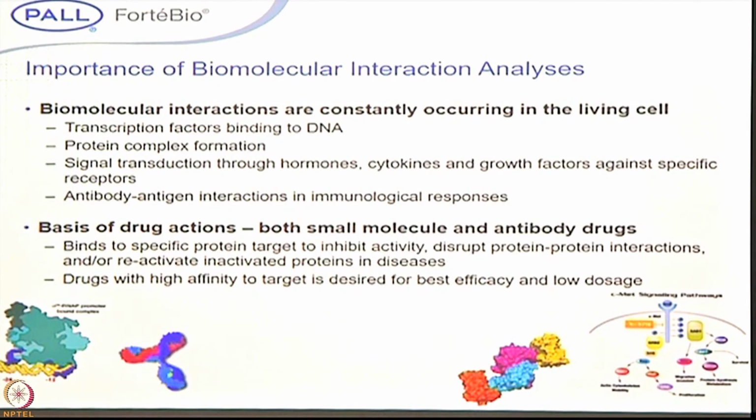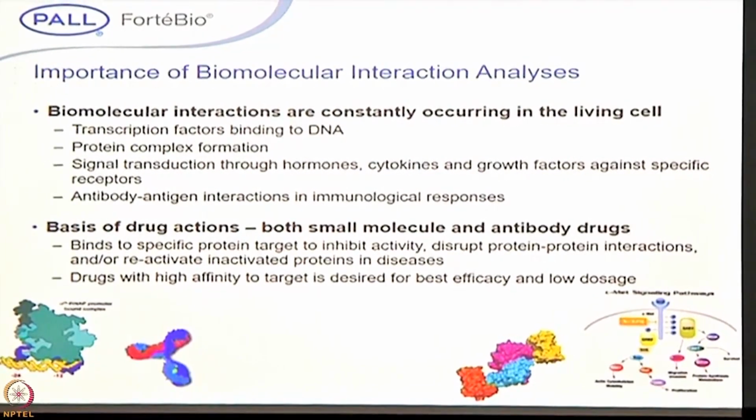Even when it comes to drug discovery, we want to understand the mechanism of interactions, how the drug is binding to the particular target. When we are discovering such kind of molecules, we have to look at the affinity. When it comes to the dose, I can give a simple example. Some drugs you have to take three times a day, some drugs once in a week, some drugs once a day. So how are all these doses decided?